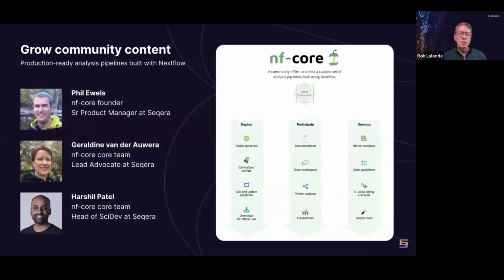By the same token, we also have the NF Core project. It's kind of an adjacent community to Nextflow, where community people are building, managing pipelines and related tooling out in the open. It's a phenomenal project. There's about 90 pipelines right now. While Seqera participates and contributes to this, there's a lot of other people in the community that are the real people behind the project and are driving things forward. And there's all kinds of people from various institutions around the globe, as well as commercial entities involved in this.